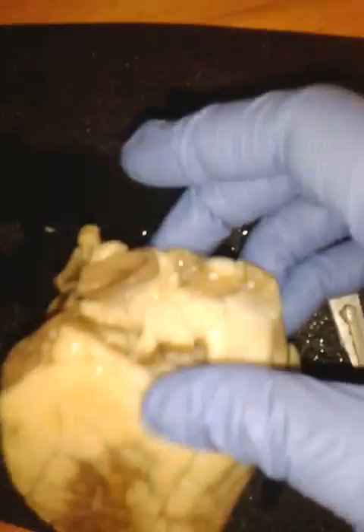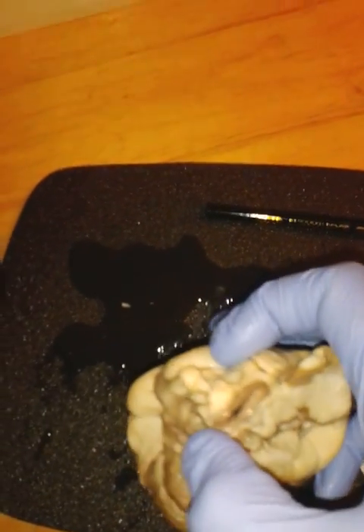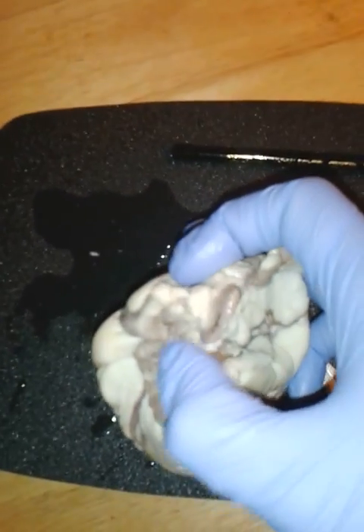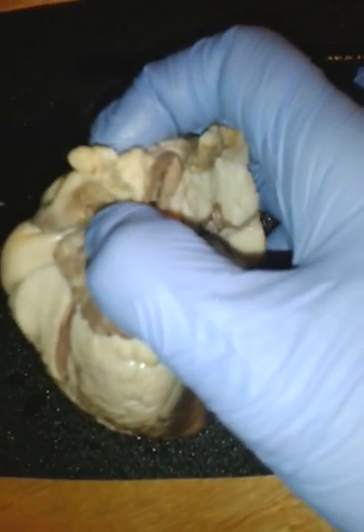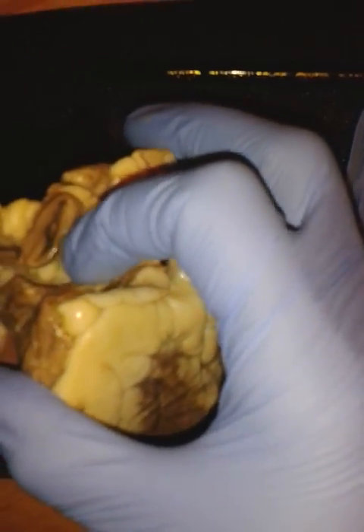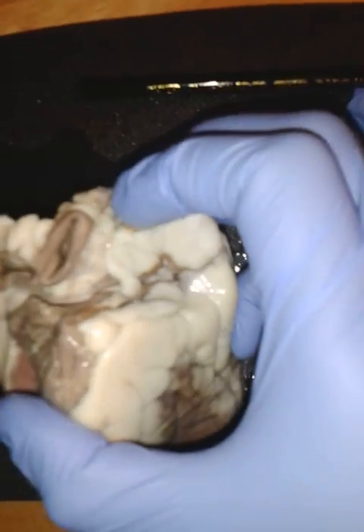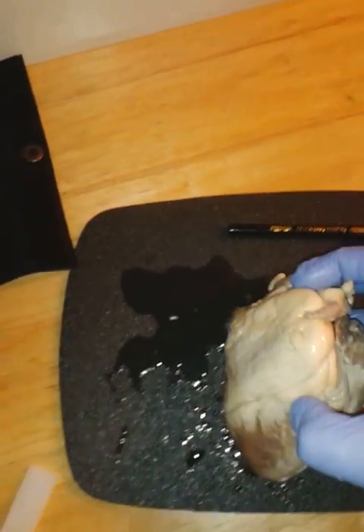Sorry, mine is not in the best shape, so we'll look at it from the posterior side so you can see it a little better. The brachiocephalic, the left common carotid, and the left subclavian. So of those, unfortunately, they're not well observed on my particular specimen, so sorry about that.